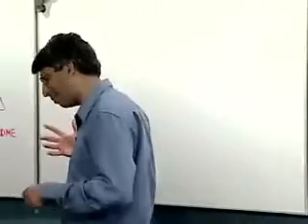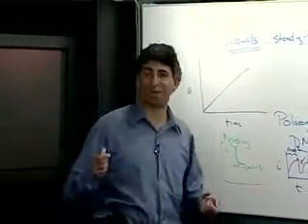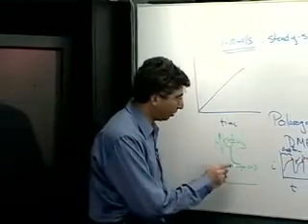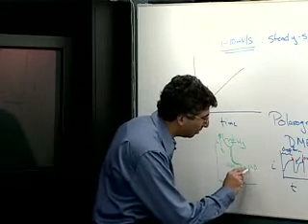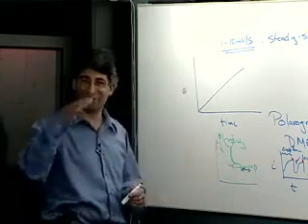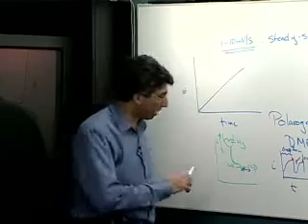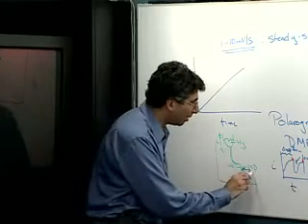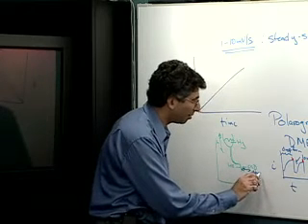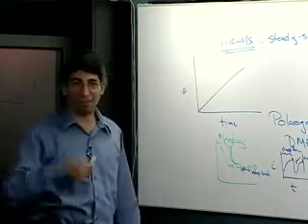And so what you want to add to your system, which was done, I believe, around in the 60s, maybe even in the early 70s, is a drop knocker. And a drop knocker is just a little piston-like thing, a little tapping device right here that goes and taps the end of your capillary, or shakes it, depending how you want to think about that. And every time it shakes it, a drop falls off. And of course, since you're controlling this now, you can knock a drop off once every second or whatever.